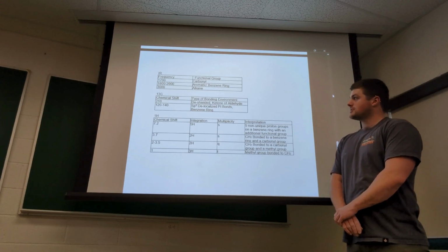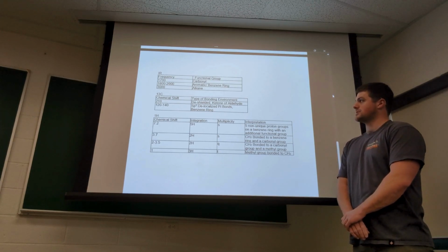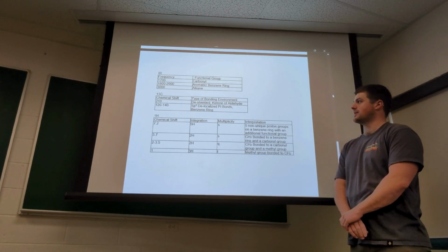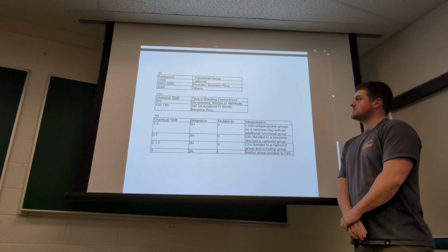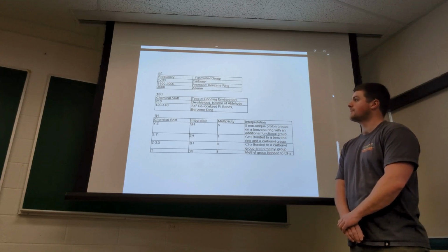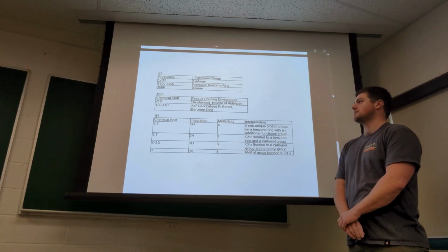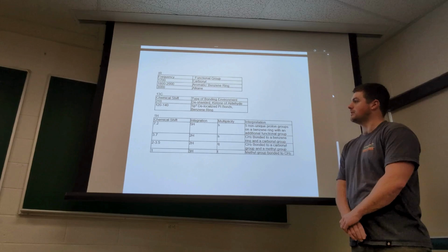In the carbon-13 NMR, we see at 210 a peak which indicates a de-shielded carbon, such as a ketone or an aldehyde. At 120 to 140, we see sp2 hybridized delocalized pi bonds, which would indicate the presence of a benzene ring. We also saw 5 peaks there, which would indicate the benzene ring has an additional group attached to it.